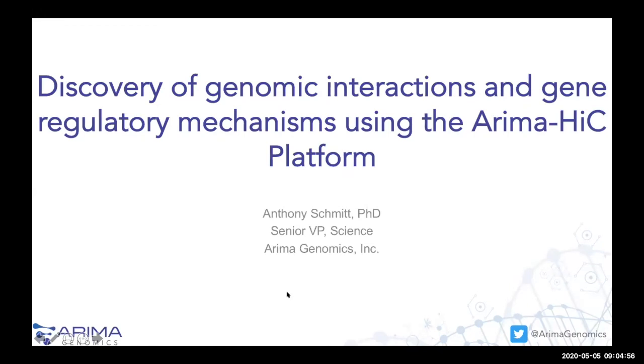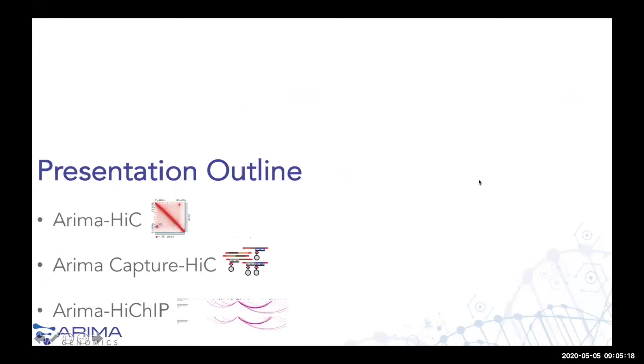I'm even more excited, I think, to hear some of the published and unpublished work that we'll hear about over the course of the next couple hours. I think my function here is really just to introduce the underlying NGS-based approaches for 3D genome mapping and genome structure analysis, and I'll go over a few of those right now. I'm going to first introduce the 3D genome very, very briefly.